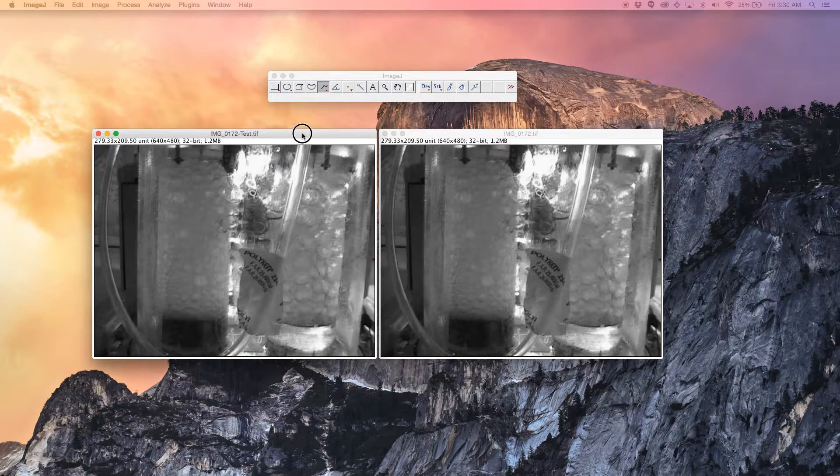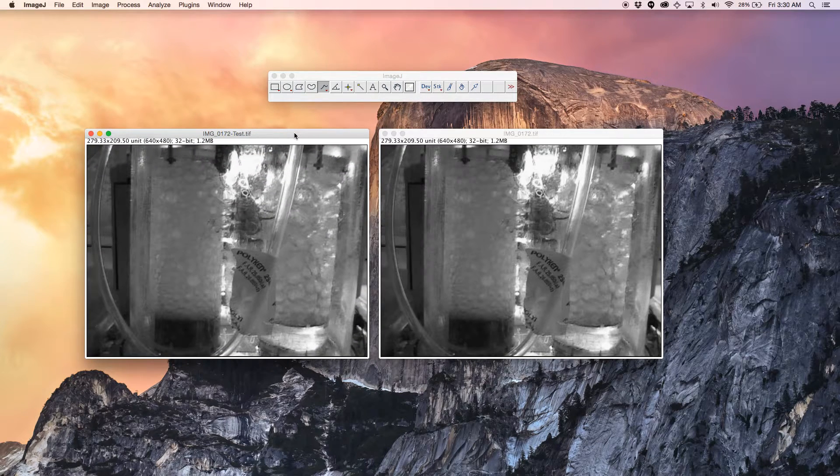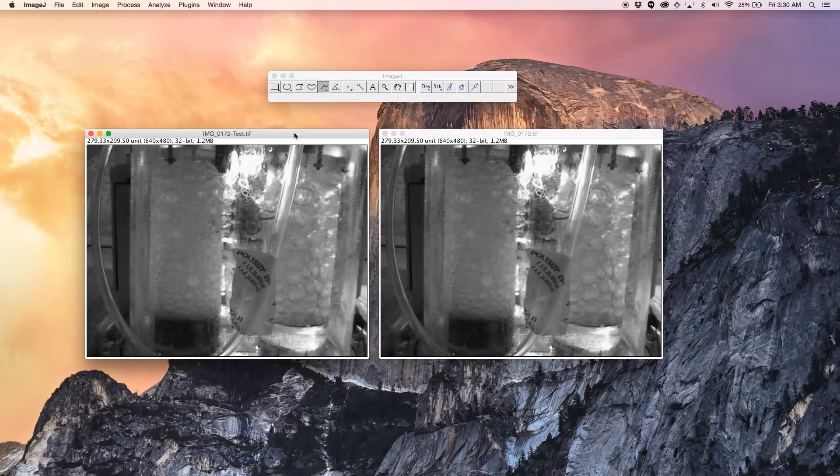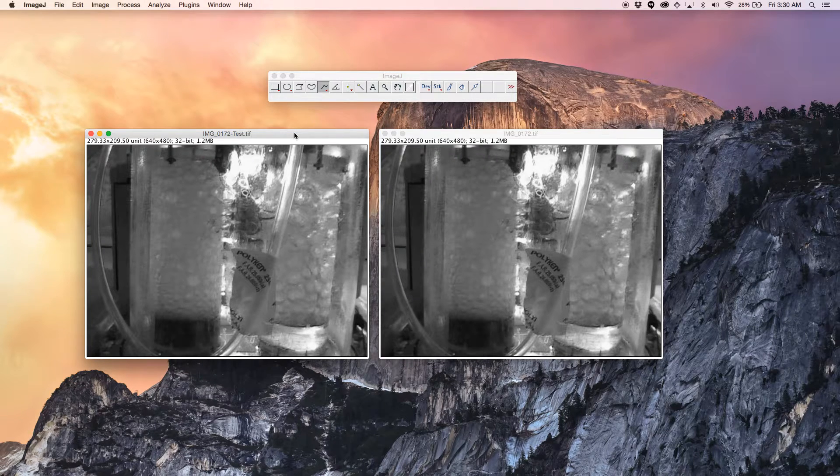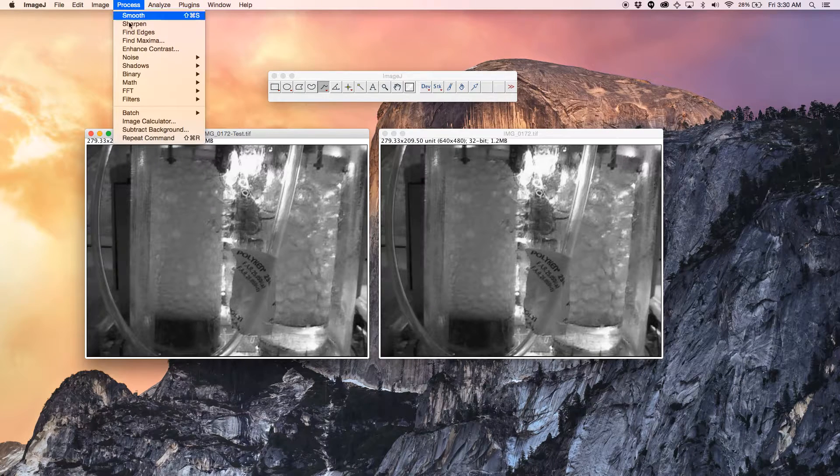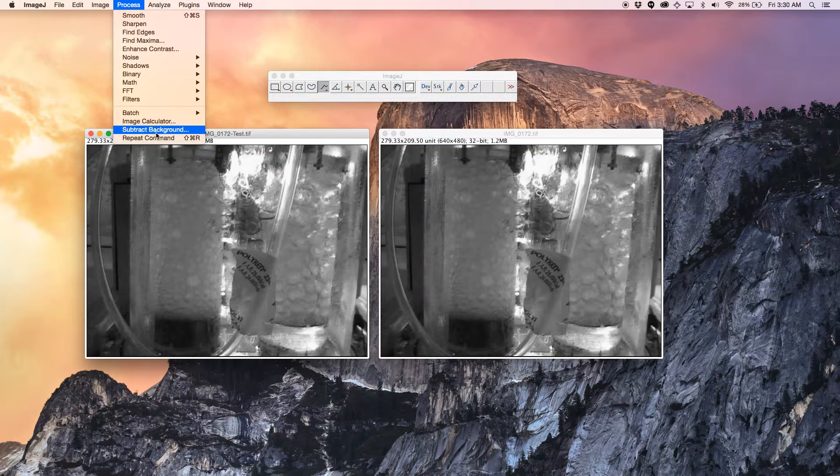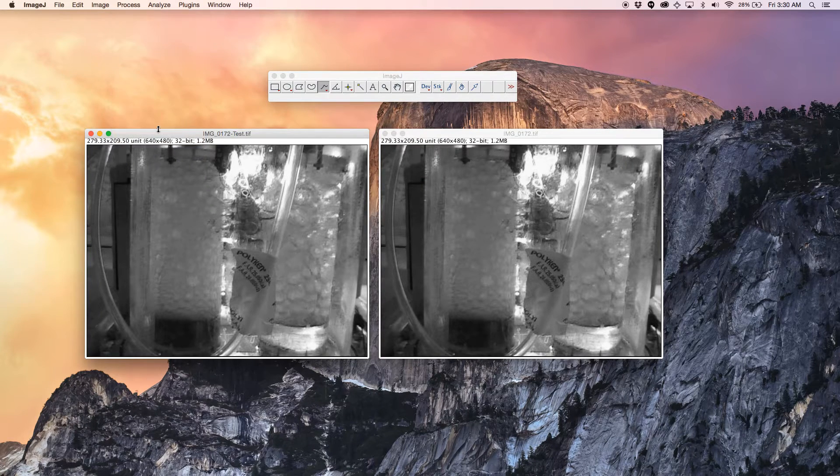I'm going to keep this one and now I'm going to subtract the background. How I'm going to do this is click the image, go to process, subtract background.